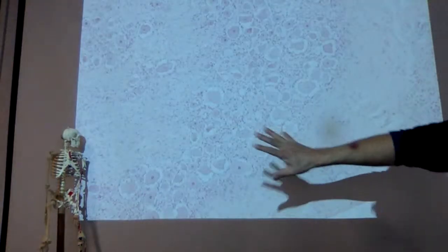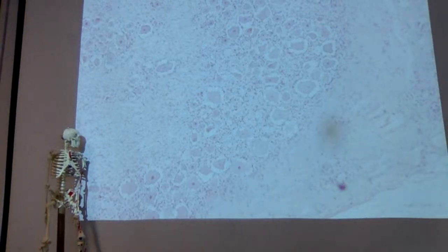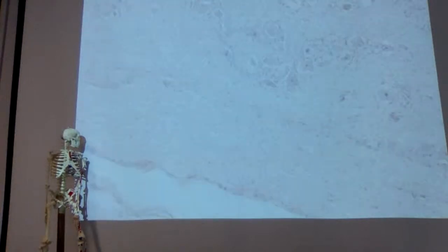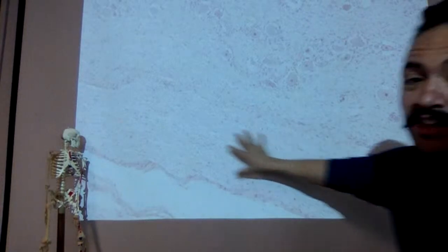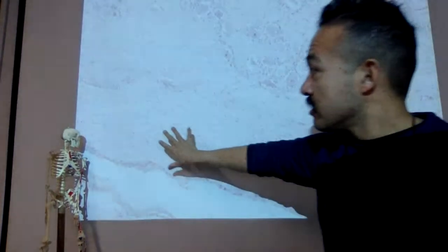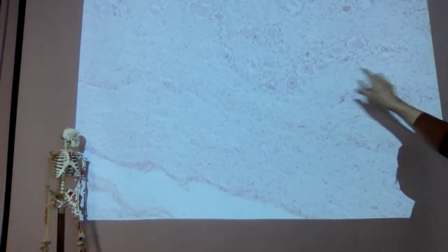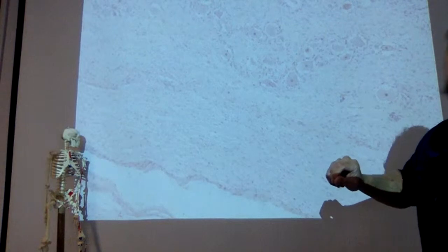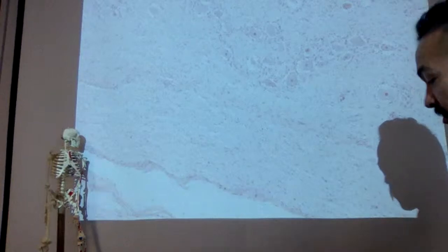We're looking at this dorsal root ganglion in histology. We have a bunch of these cell bodies clustered in one area. But then in other areas, we have very few neuron cell bodies. All of this is axon. These are all axons in longitudinal cut. These are neuron cell bodies clustered together off to the side, and a longitudinal cut of axons.